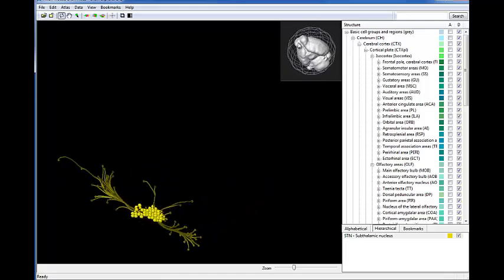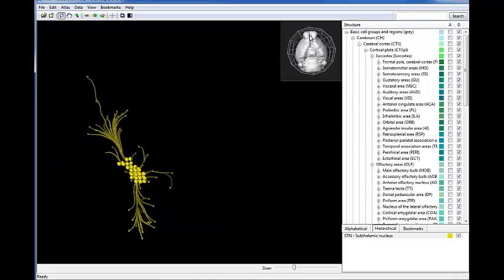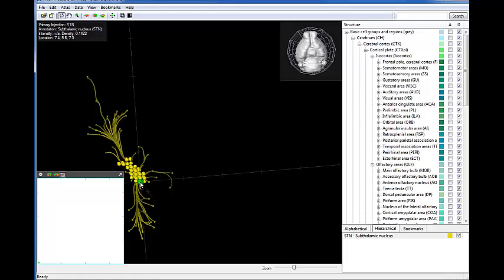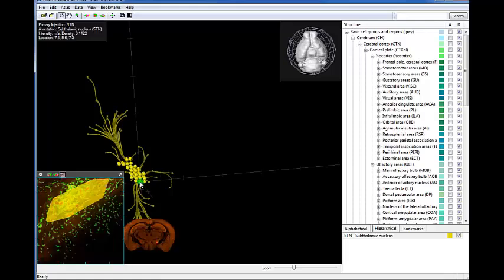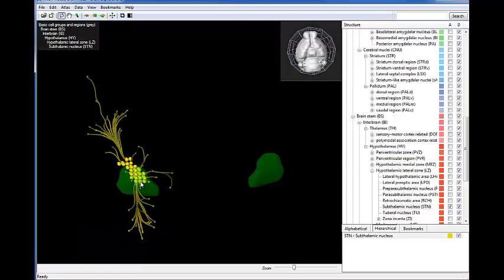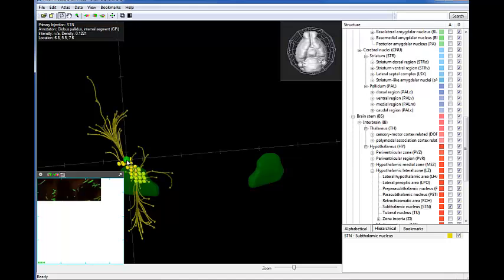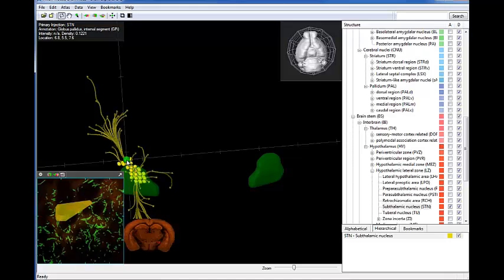The fluorescent signal starting at the injection site, indicated by the spheres, was traced using a fast-marching algorithm until the signal was no longer detected, indicated by the cubes. The resulting streamlines show the shortest path from the injection site to where the signal ends. You can see projections from one structure to another.